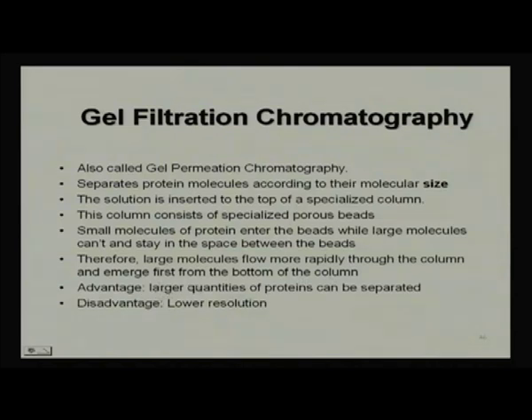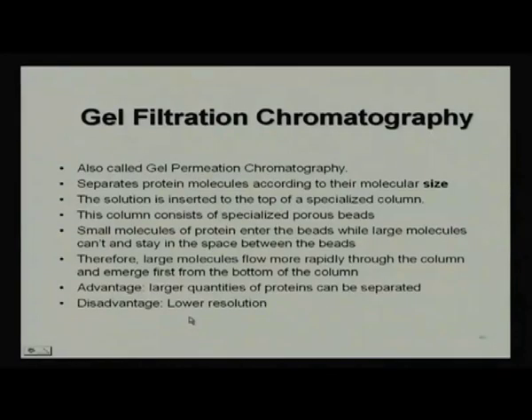The advantage is that larger quantities of protein can be separated through this type of chromatographic technique, and the disadvantage of this particular process is that lower resolution is there. We are not getting a very high resolution through GFC, that is gel filtration chromatography.